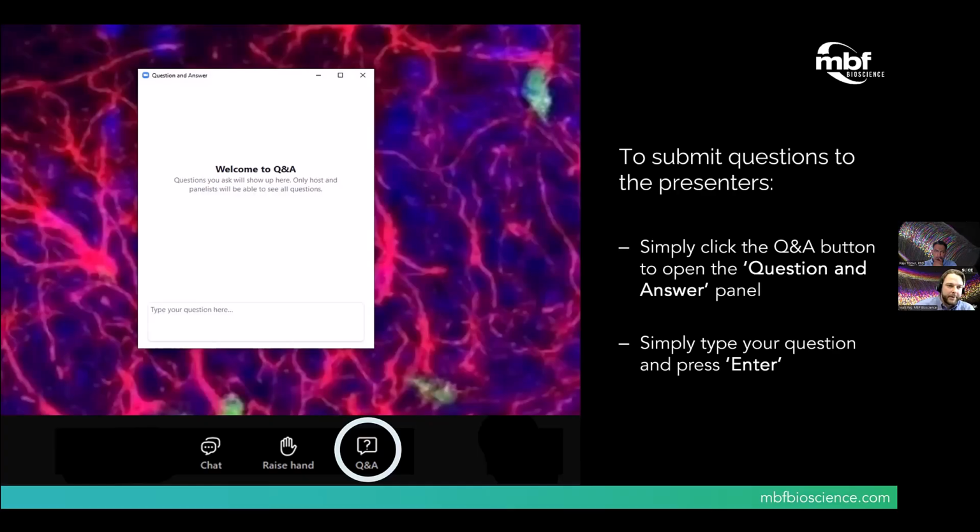I see another question about the size of the cuvettes. The cuvettes we're offering are a 10 by 5 millimeter, a 10 by 10 millimeter, up to a 20 by 20 millimeter cuvette, which pretty much covers the full scanning range of this slice microscope at this time.